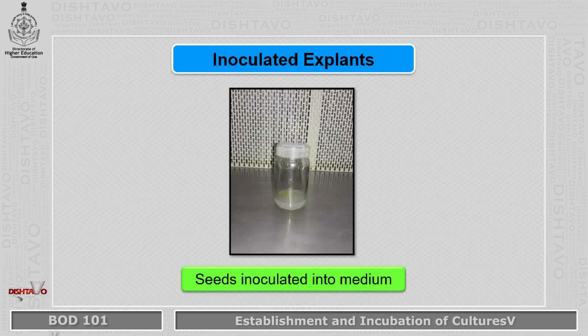Now this explant that is inoculated has to be given the ideal conditions to grow.